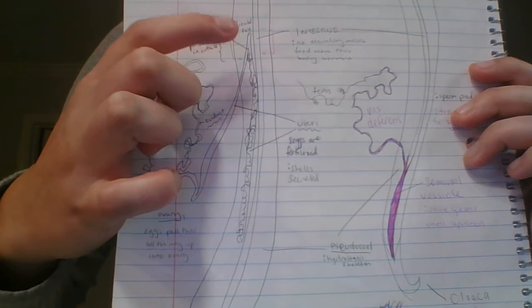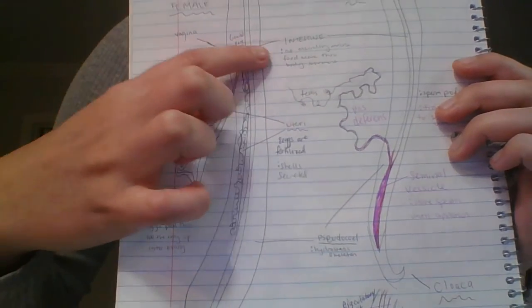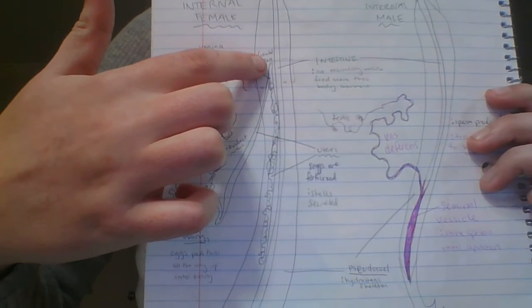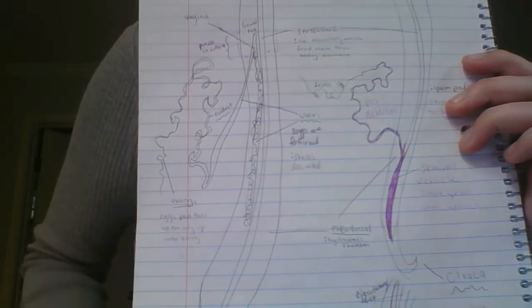How does the sperm get into the female? Through this genital pore. We can see it's marked by the pinch in the cuticle, and basically this latches onto the female right here. The sperm is ejected into the female at the genital pore, entering the vagina right here, traveling down into the uteri, where fertilization happens. Thank you so much.